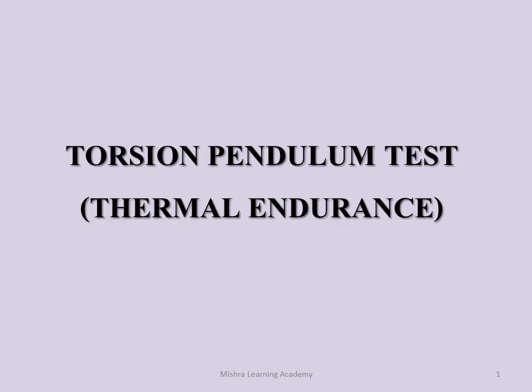Today in this video we are going to talk about one of the tests of plastic, that is the torsion pendulum test. The other name of torsion pendulum test is thermal endurance.